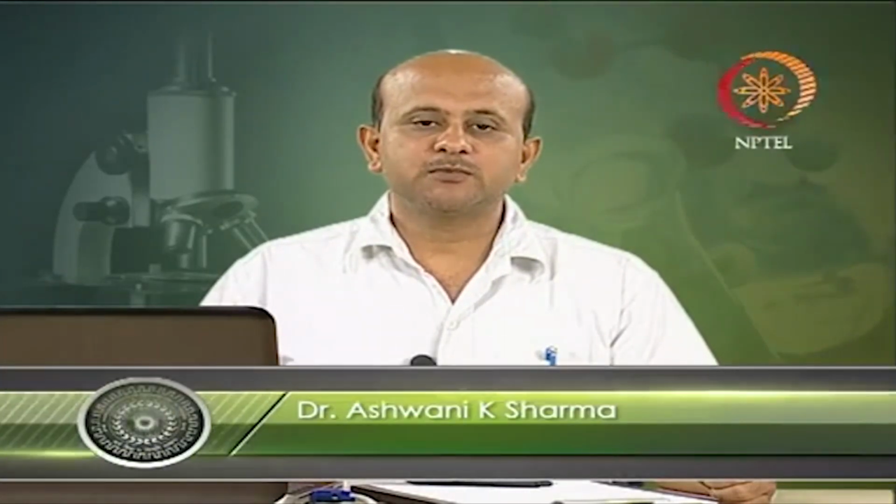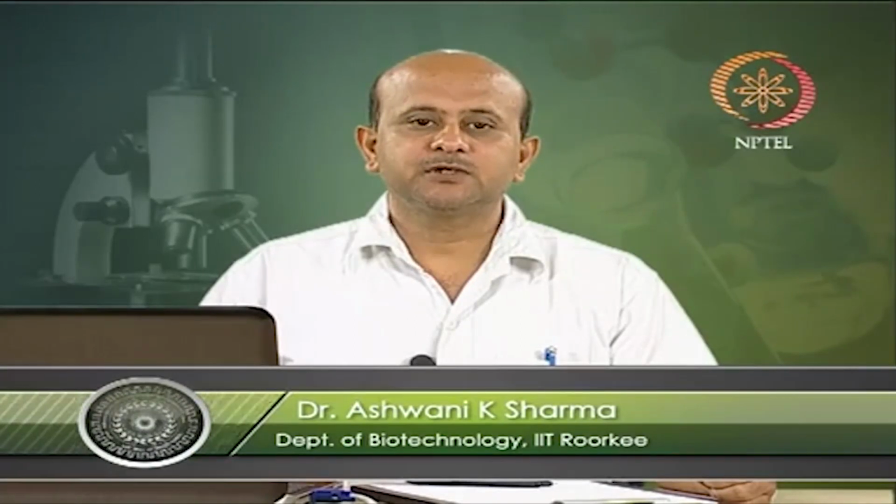In this lecture we are going to discuss two techniques. One is atomic spectroscopy and the second one is mass spectrometry. Both are very useful techniques for application in different areas of biotechnology. Now, let us first discuss atomic spectroscopy.